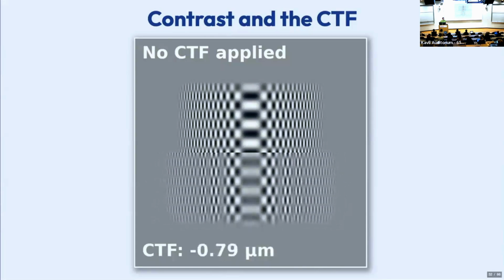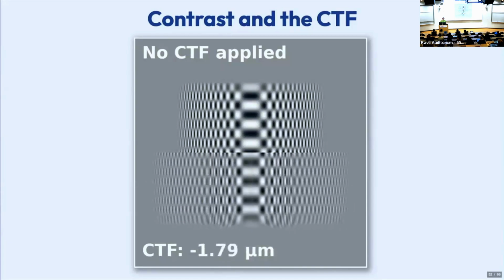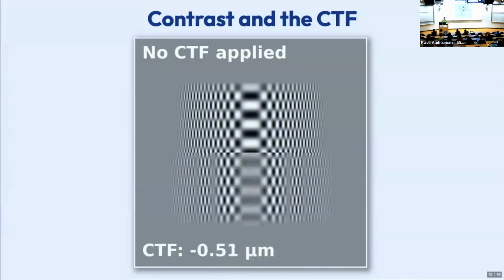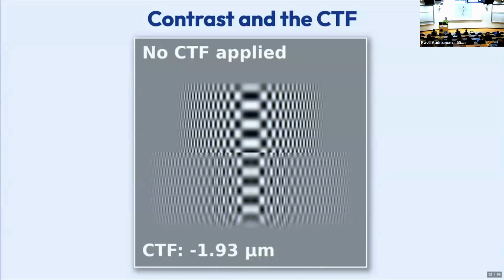And then there are other techniques you can use to help resolve that flexible bit, things like local refinement, particle subtraction, flexible refinement, 3D variability. And we'll talk about all those during the next 2 days. So I think there are more computational based approaches that I would take, as opposed to a physical change, something about the microscope approach.